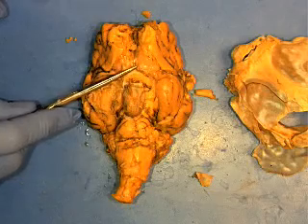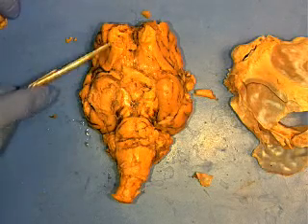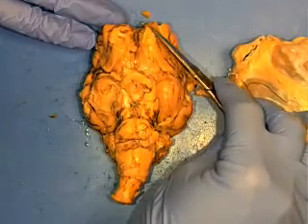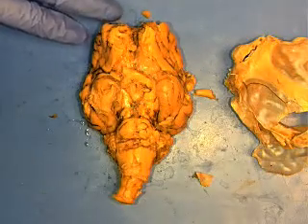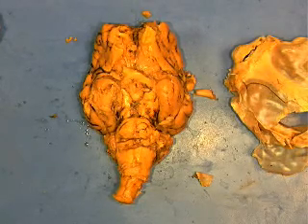Above the pituitary gland, there should be a crossing or an X-like structure. It's a crossing of the optic nerves. It's called the optic chiasma. And then this one doesn't have very good ones, but there's an olfactory tract, and there should have been a bulb at the top of it, but it's degraded, so you can't really see the bulb that well, but that is the olfactory tract and the bulb. Let me see if I can make that just a little bit clearer for you by adding some color to it.